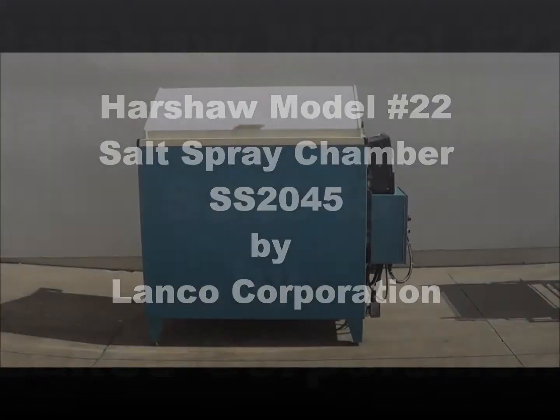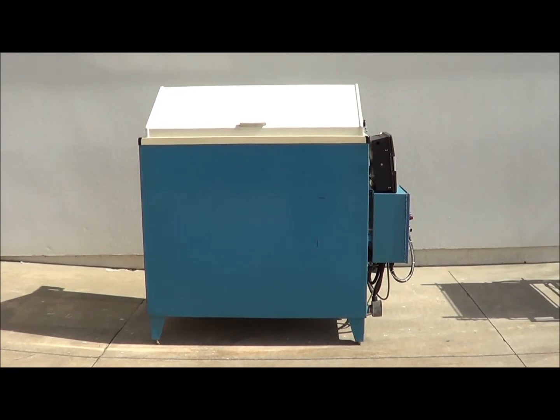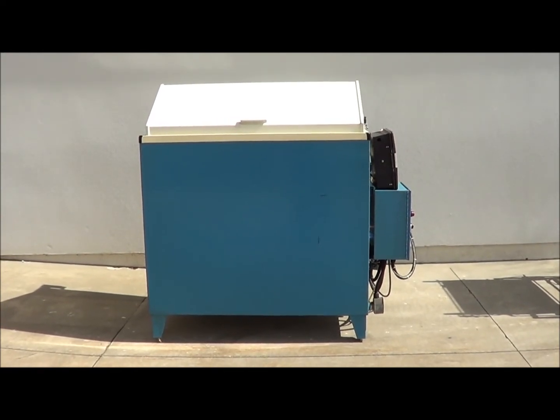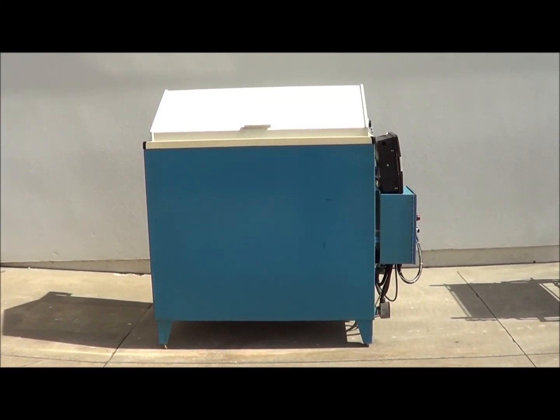Hello, today you're looking at a Harshaw Salt Spray Chamber brought to you by Lanco Corporation. This is Harshaw's Model 22 Salt Spray Chamber.